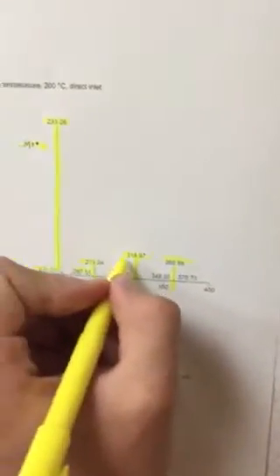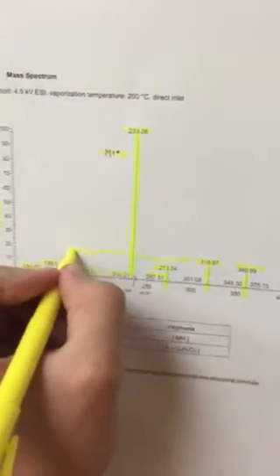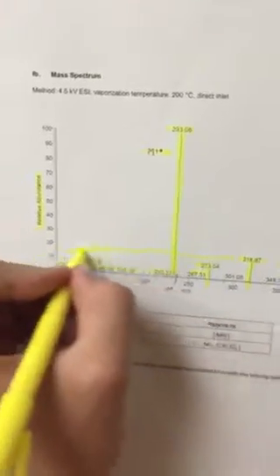So if we're looking at 318 and we come over here, I know that's a little zigzaggy, but it's kind of around 18 to 20%. That is saying, after specific functional groups have broken off of that ion, how relatively abundant it is in nature. So once again, this is mass spec, and that's dealing with the ions abundant in nature and their relative abundance in nature.